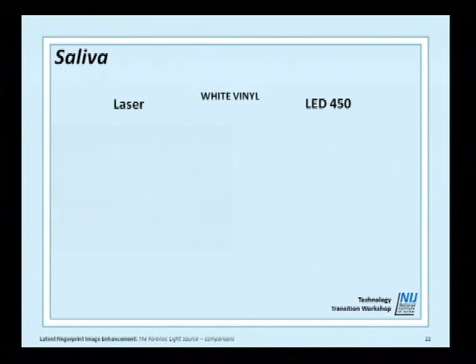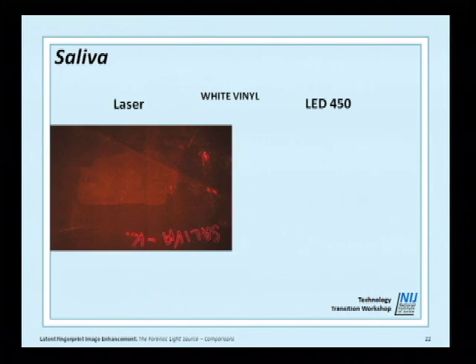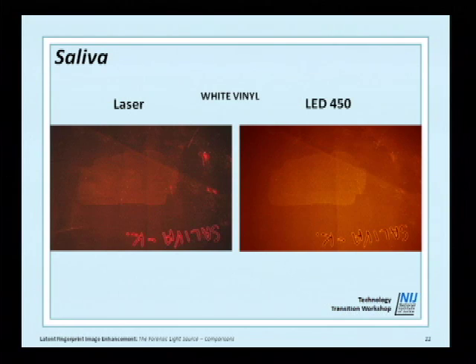So this was on white vinyl. Yeah, these are tough. Actually, in some cases, what you're going to see is basically little or no difference. But I think you can see there's a little better relationship between the background and the saliva in the laser. That's good, thanks.